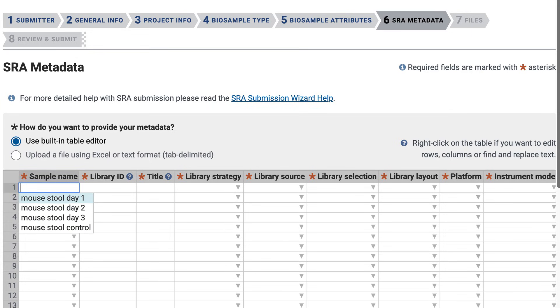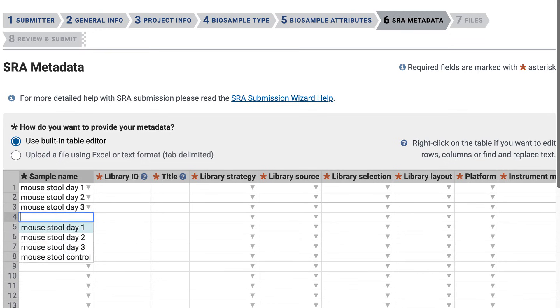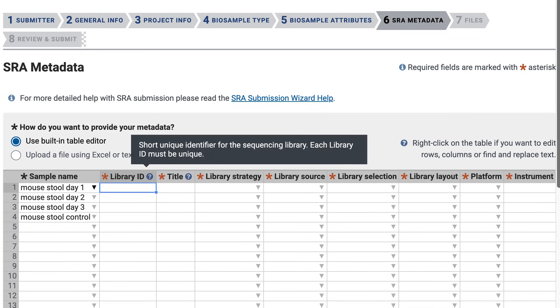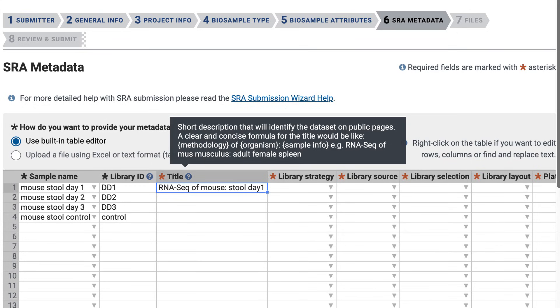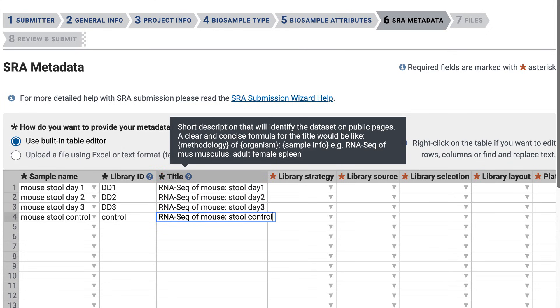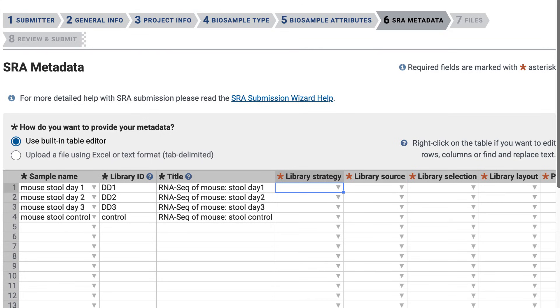Next are the library IDs: dd1, dd2, dd3, and control. Then I'll add this title — rnasek of mouse stool day 1. Note that these titles will be displayed on public pages, and be sure to include specific sample names or library IDs. Here I've used stool day 1, etc.